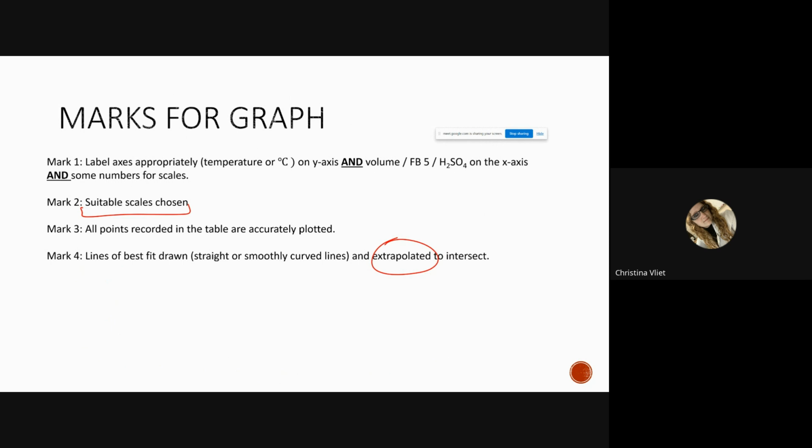All right, head to the back of the lab table before you touch anything. Grab gloves. You're working with sulfuric acid.